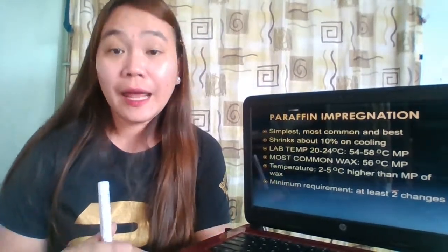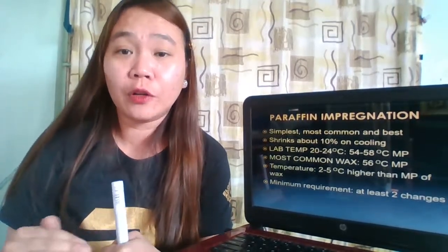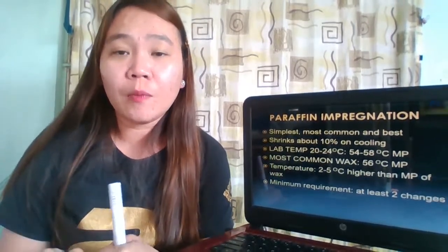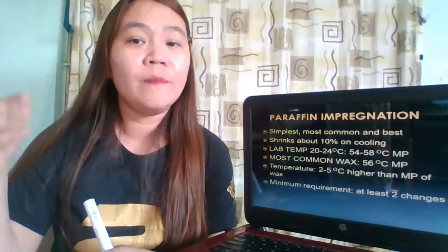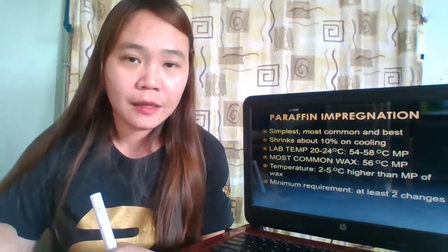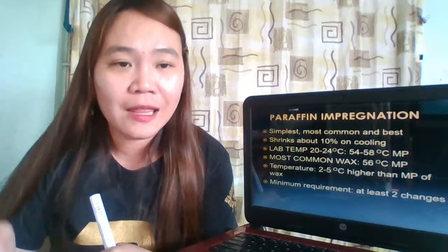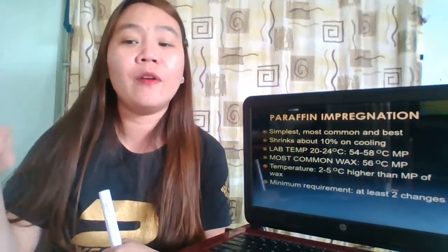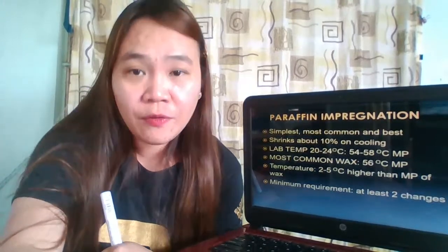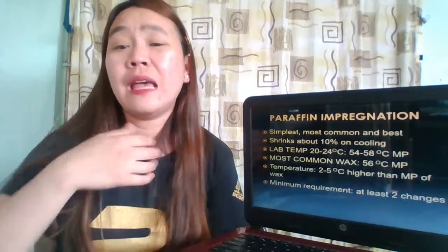So, back to the factors that we have to consider. Laboratory temperature of 20 to 24, the melting point of the wax is 54 to 58. Laboratory temperature of 15 to 18 degrees Celsius, what should be the melting point of the wax? We have 50 to 54 degrees Celsius.